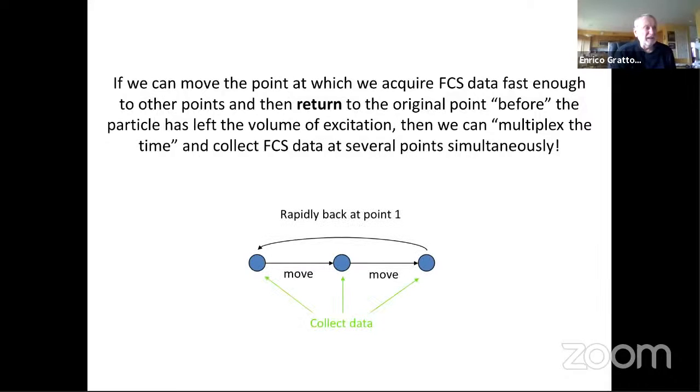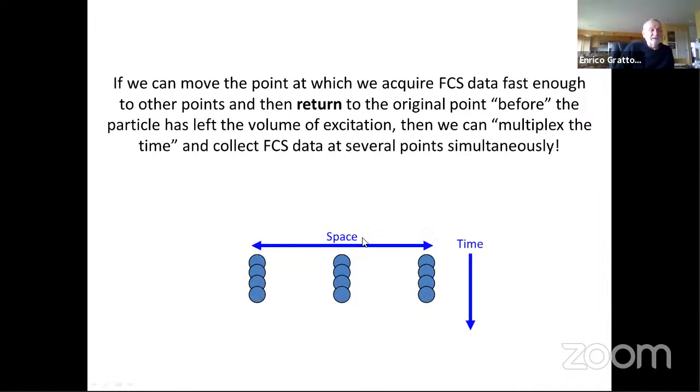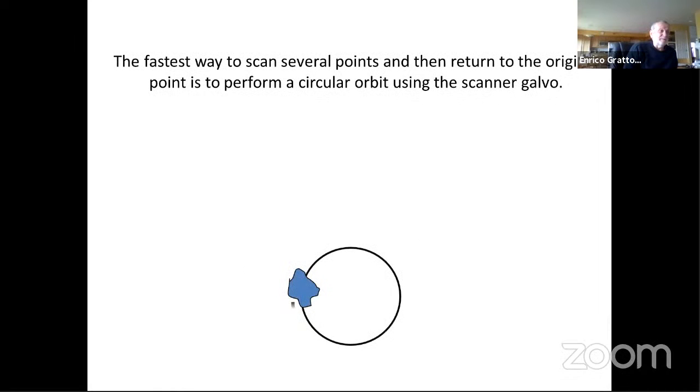Susanna mentioned that I will talk, but I didn't at that time, about scanning rapidly a line or a circle, which is faster, and then come back to the various points. And then she talked about dividing the data in the carpet and plotting the carpet and so on.